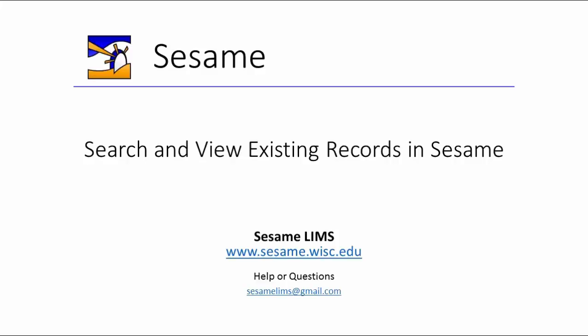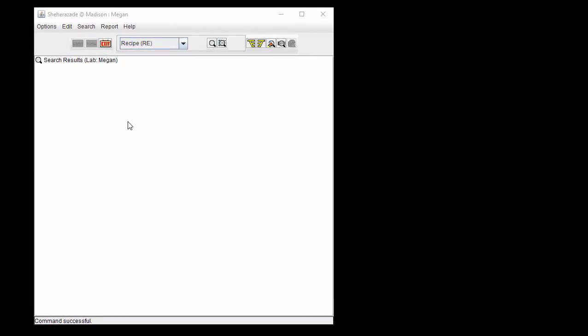Hello, and welcome to this video tutorial on how to search and view existing records in Sesame. There are three methods to search for a record in Sesame. This is the same in all of the modules. For this tutorial, we will log into our lab in Scheherazade.